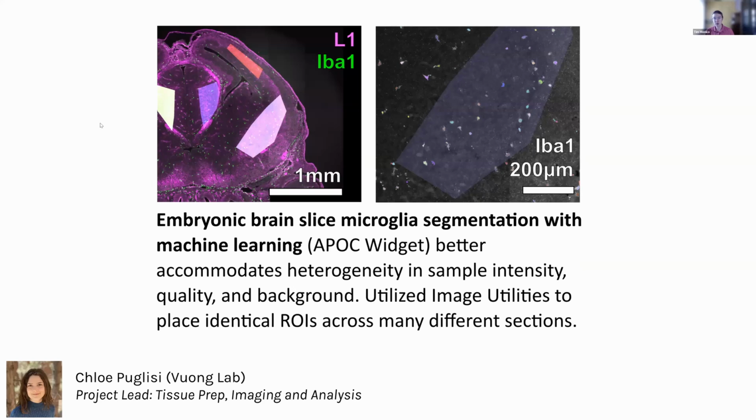Here's a different example where now we want to actually annotate multiple different brain regions on a whole slice. I've actually cut off the rest of the slice. And we have really challenging cells to segment. One reason, if you're familiar with doing fluorescence on whole tissue samples, is you can see there's a lot of autofluorescence and background signal with certain channels due to the meninges around the brain and things like that.